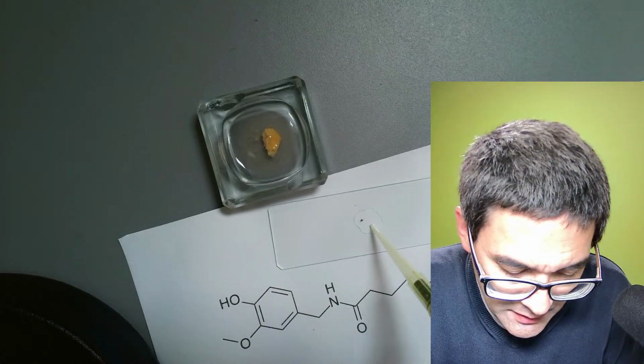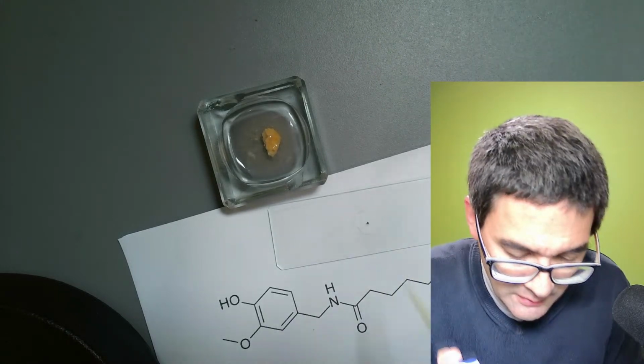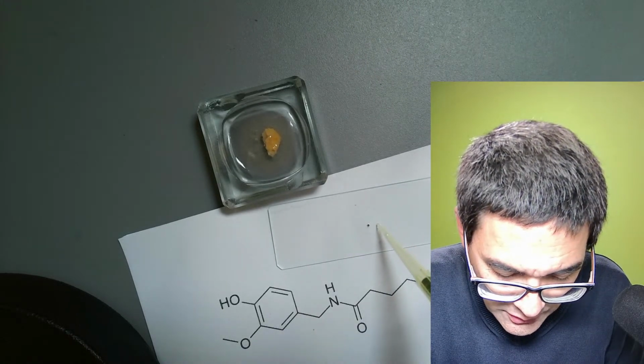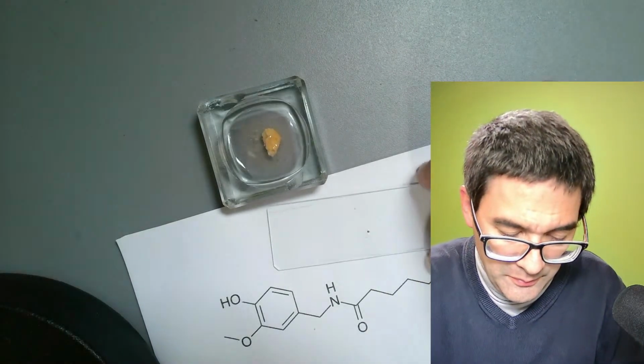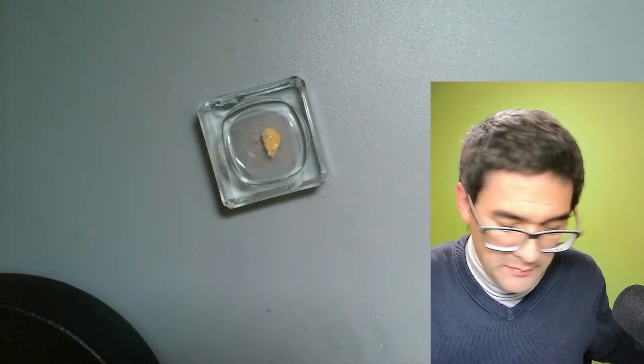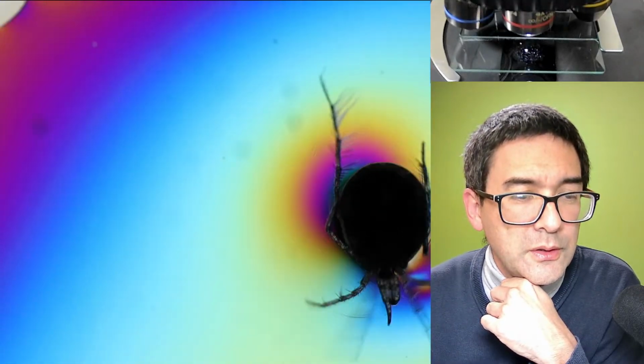Because this will also limit the movement a little bit, and when I add more of the liquid later on, it will also be a little bit more concentrated. So let's have a look again. Okay. Let's have a look again. I need to change the view, scope view. Here we go. Here it is.